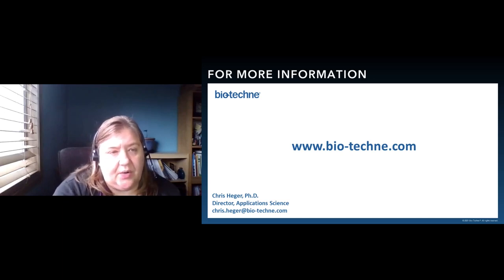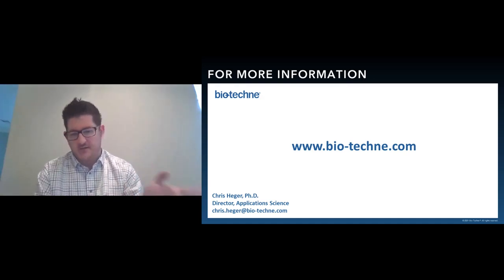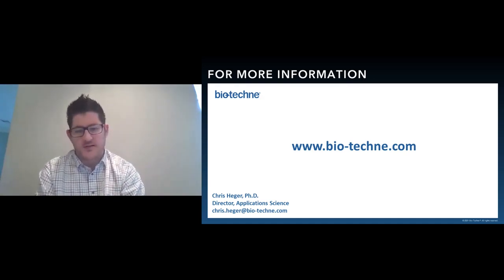Okay, so can you comment on why the IEF peaks change between intact versus denatured AAV samples? Yeah, and this has been published, the viral proteins themselves, of course, have an isoelectric point, as all proteins do.